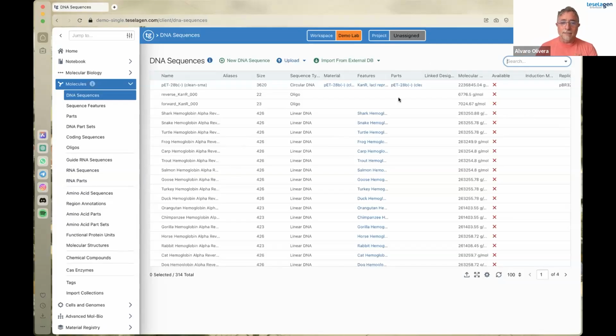So with this, I just will stop my demo. I just wanted to show you how these 2 tools are used and how they work. And I go back now to Jota, and we will continue with QA.